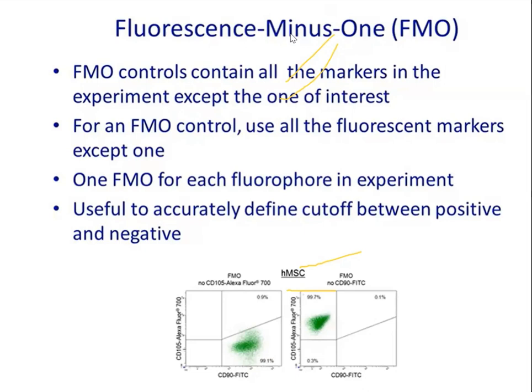Again, you need to recompensate. Because if you adjust the voltage of fluorescent channels, what happens? We spoke about PMT, right? PMT is a very sensitive one. If you adjust the voltage, then whatever compensation you have done will go to waste because it becomes invalid. Okay? So, is that clear, Dr. Lakshmi? And any other doubts? Any other doubts?